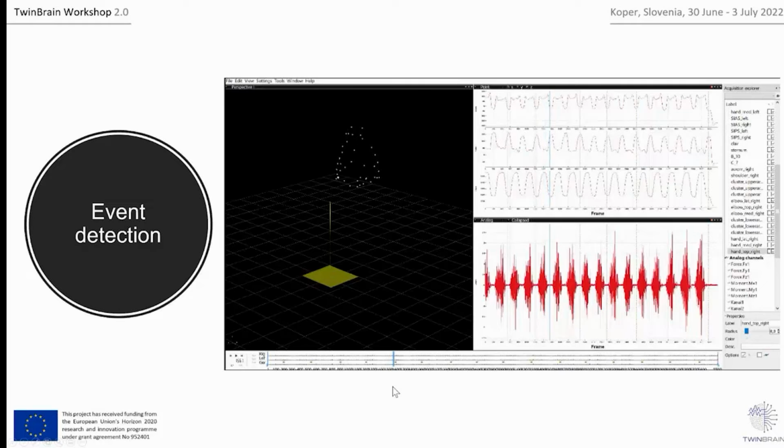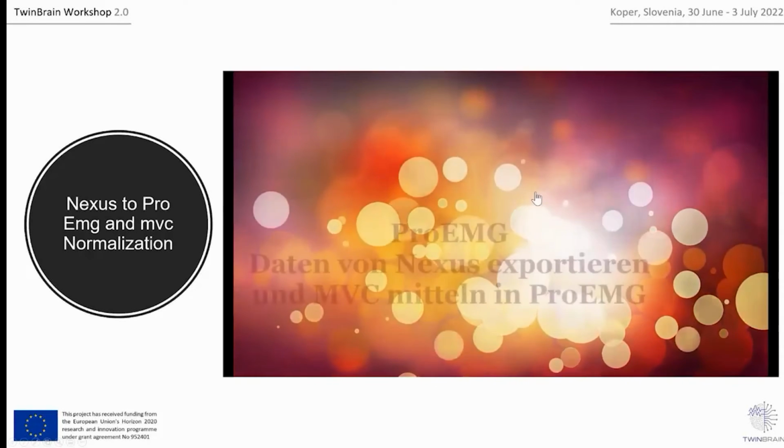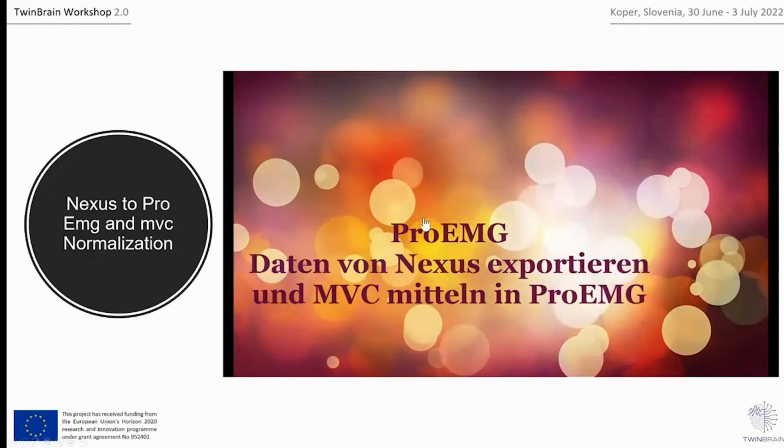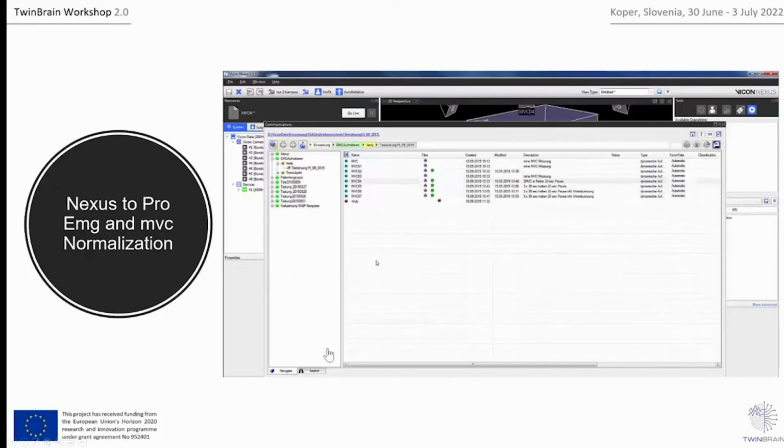So everything afterwards is based on the event markers, so you have to make sure that the event markers are placed properly, because otherwise you will alter your data and your statistics will become false. So I'm using a few videos we did prior, because unfortunately I can't use the real MATLAB data at this point due to licensing issues.